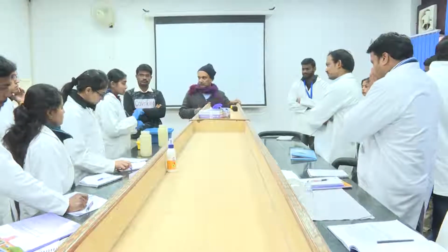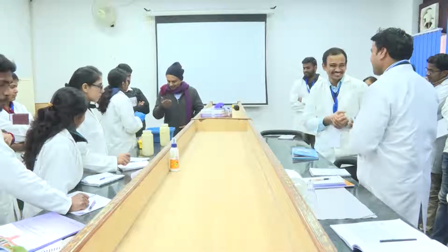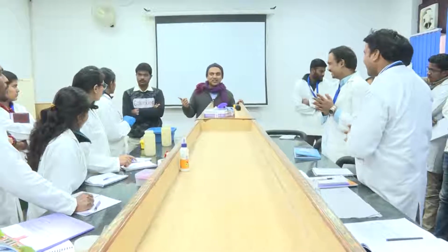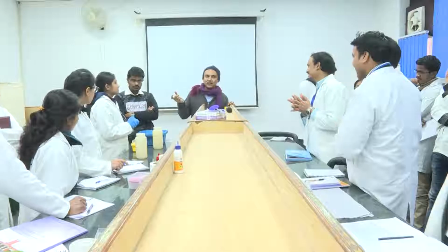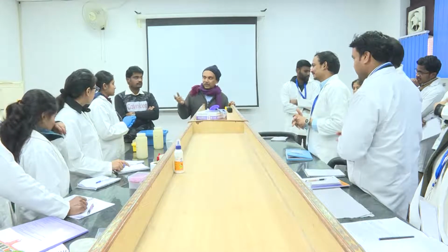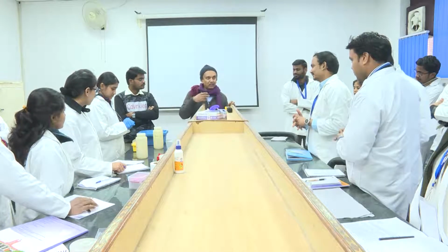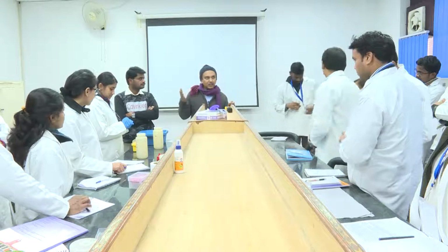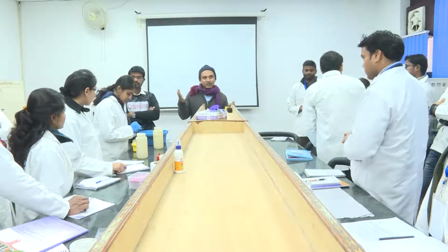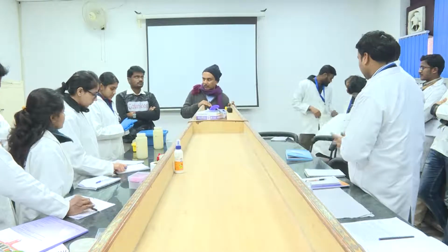Okay. She is telling me that she has brought a different DNA sample. So in addition to pipetting, which may introduce some variation, we will also see how DNA samples from 5 different environmental matrices compare in the gene copies we are going to quantify.